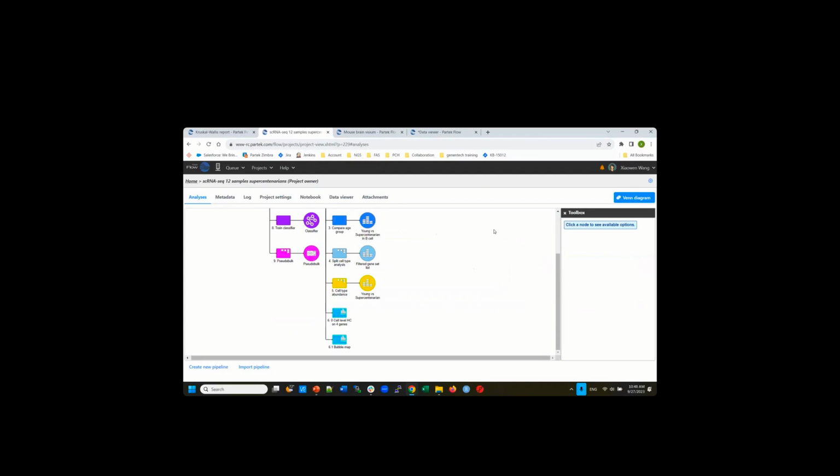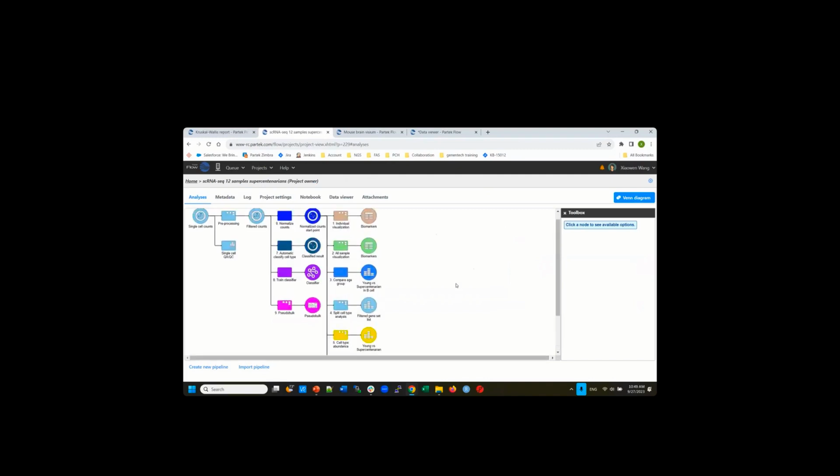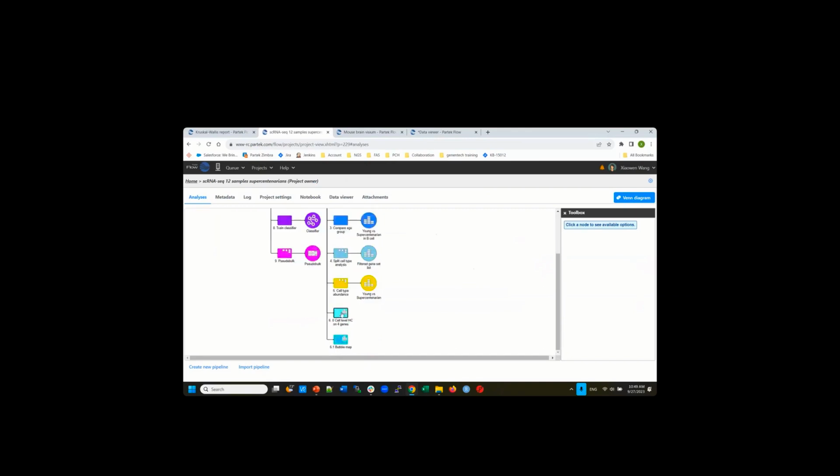So suppose you have the genes of interest, and you want to show people that they can differentiate the different groups. I want to show you a heat map. It is a nice way to look at multiple genes. Suppose here I got 4 genes.